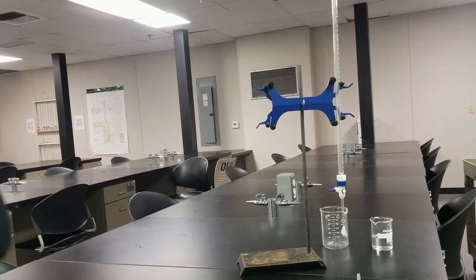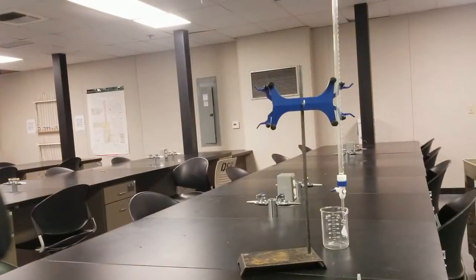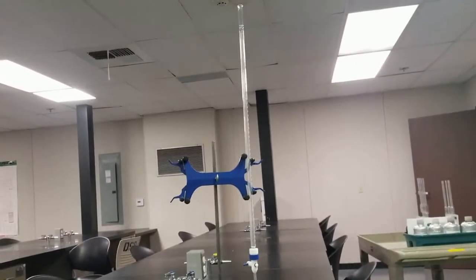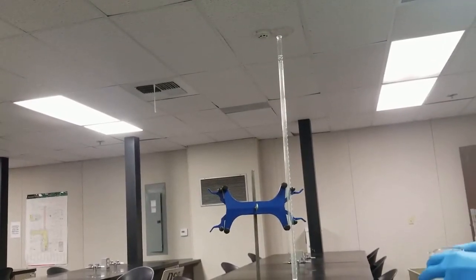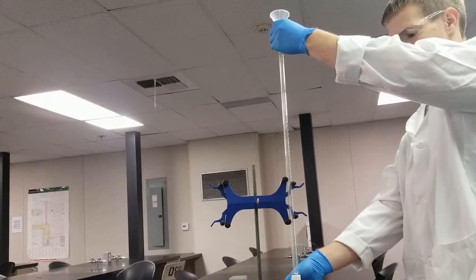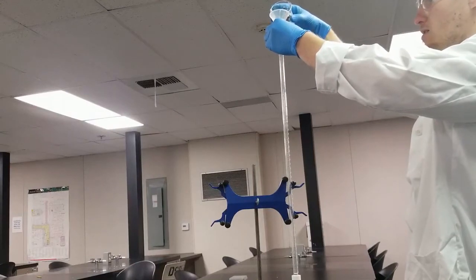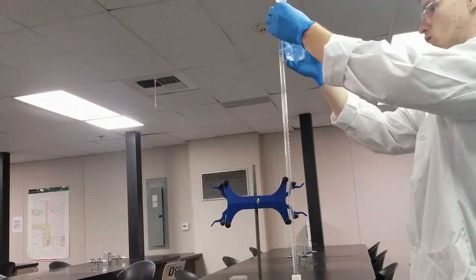All right, so the first step in our titration is to condition our burette. As you can see here, I've got my solution of silver acetate, and I'm going to use it to condition this burette. Currently my burette is empty, so I'm just going to fill it up just a little bit to condition it. So go ahead about eye level. I want to put our funnel up here, and then hold it just a little bit so that the air has somewhere to escape. Make sure your burette is closed, and then just pour in a small quantity of whatever is going to end up in here, in this case, the silver acetate. Should be good.